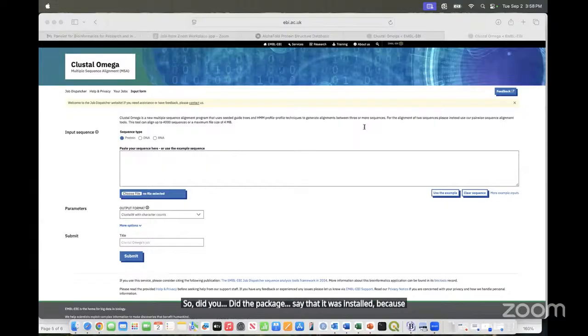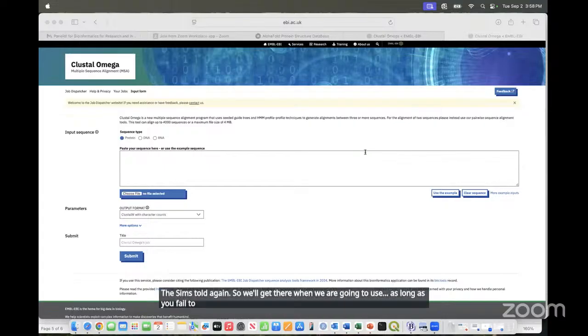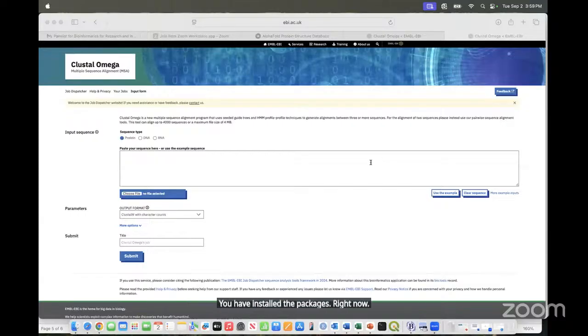We haven't reached where you're supposed to load yet. As long as you have installed the packages, just leave it there for now. We'll get there when we are going to use them. But as long as you have installed the packages, right now don't try to load those libraries. Okay?